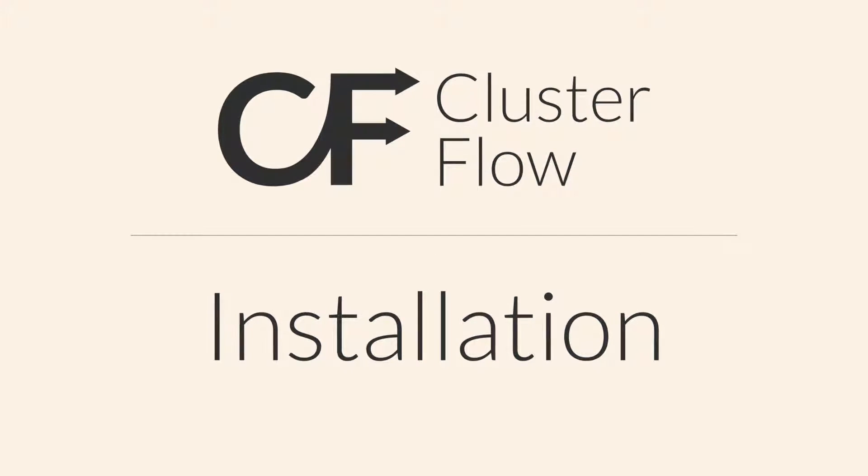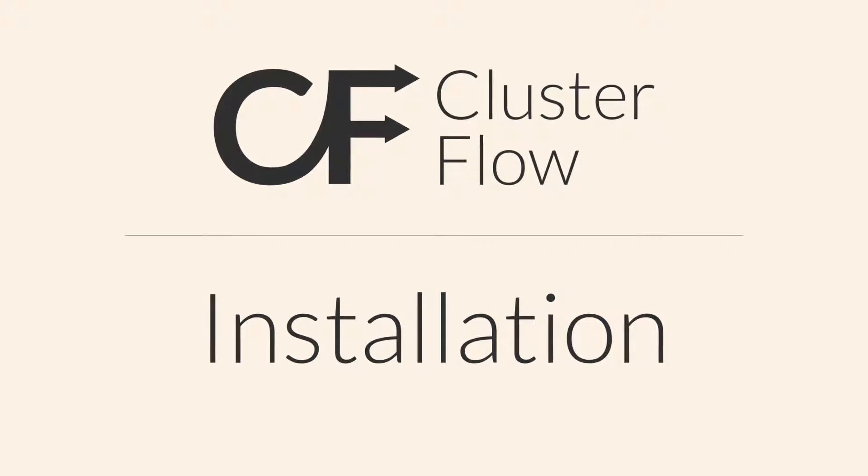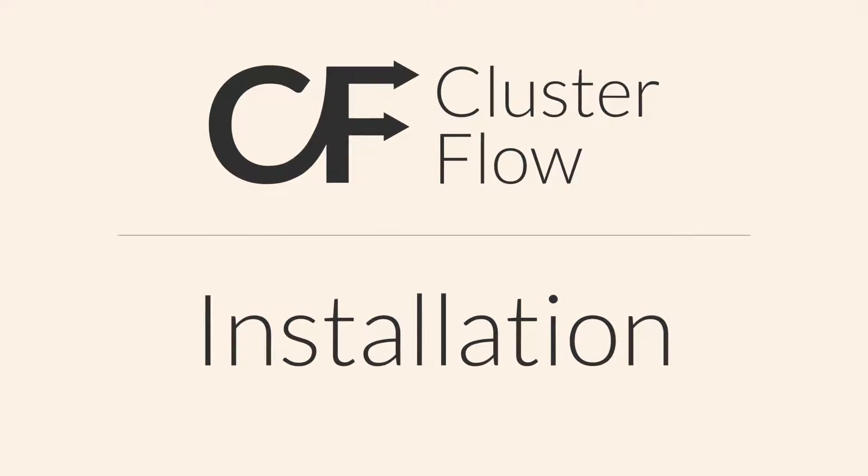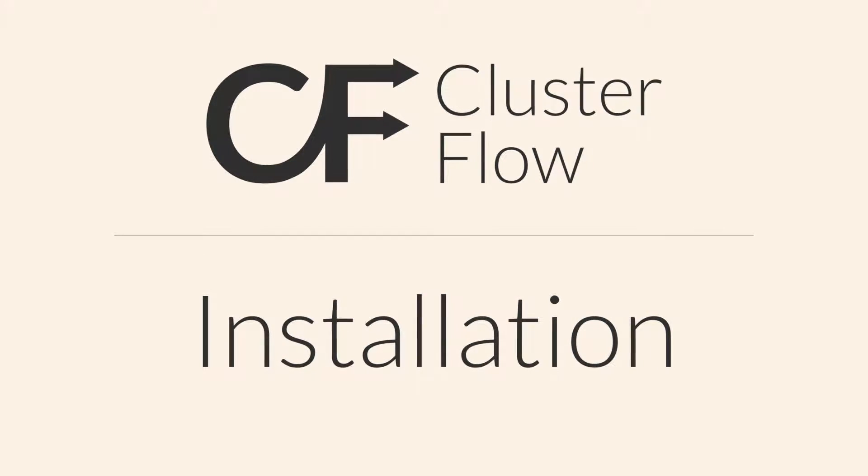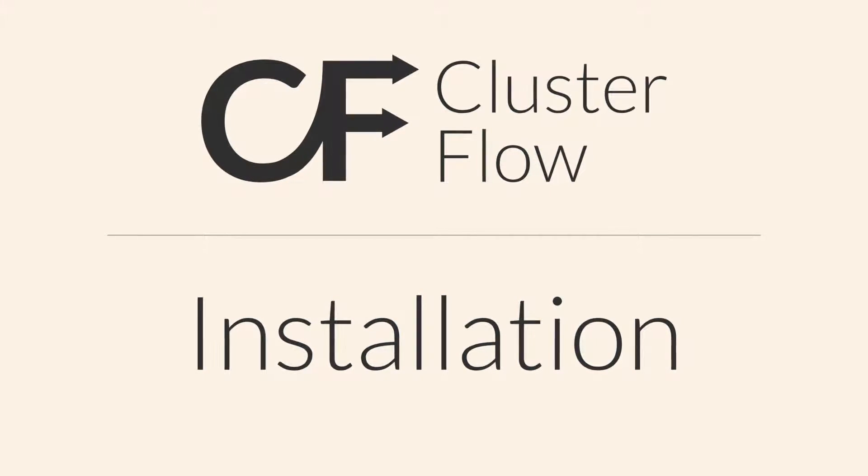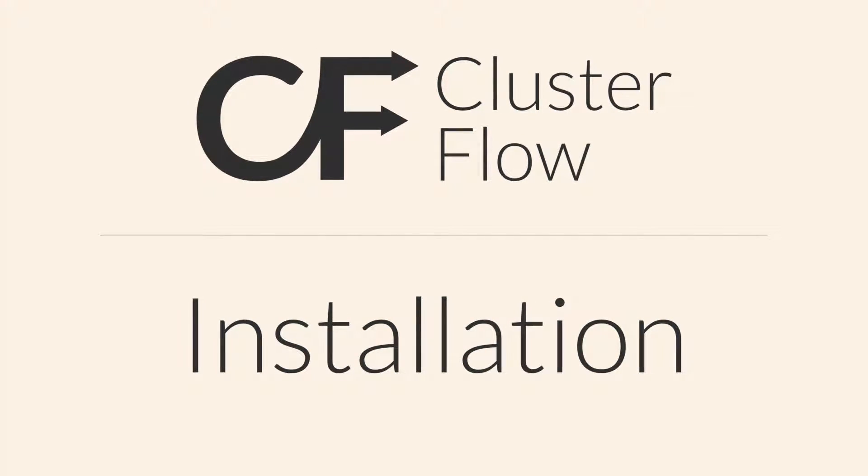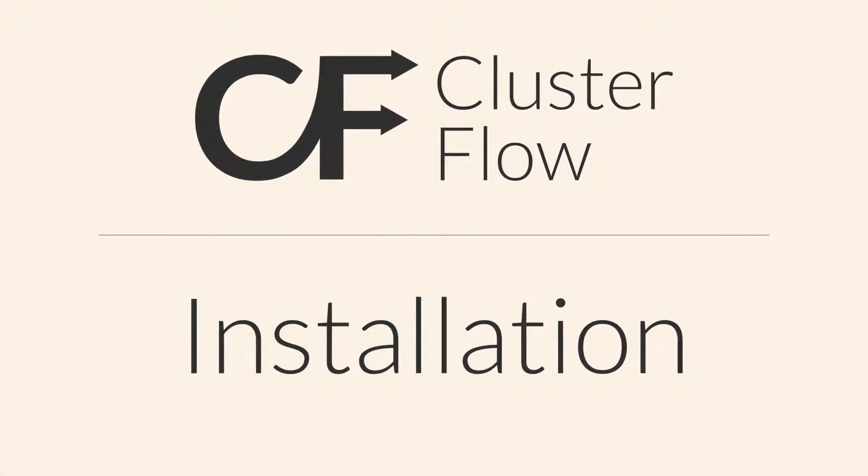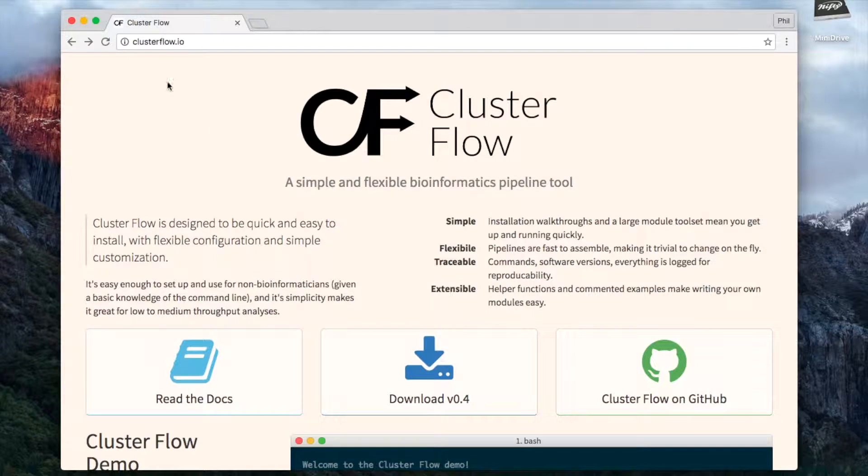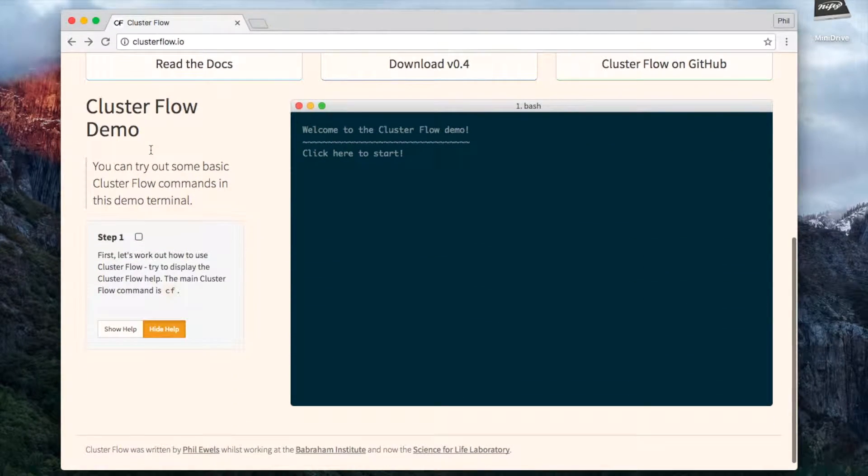Welcome to this tutorial video on the installation and configuration of Clusterflow. Clusterflow is a workflow manager or pipeline tool for running high throughput next-generation sequencing analyses. You can find out more about it at clusterflow.io, and it should look something like this where you have an interactive demo and other things you can look at.